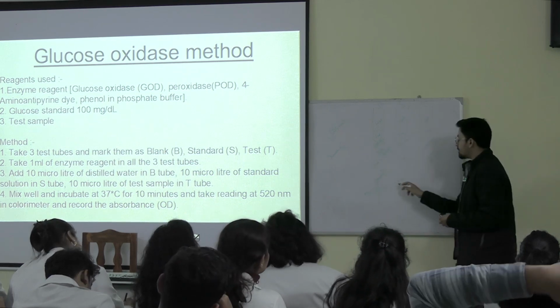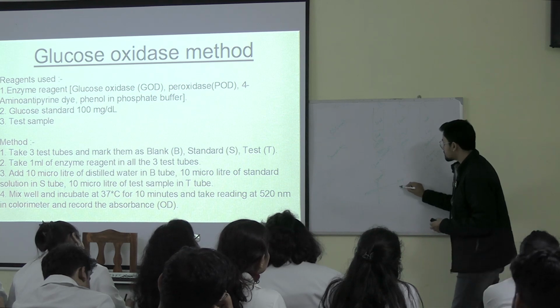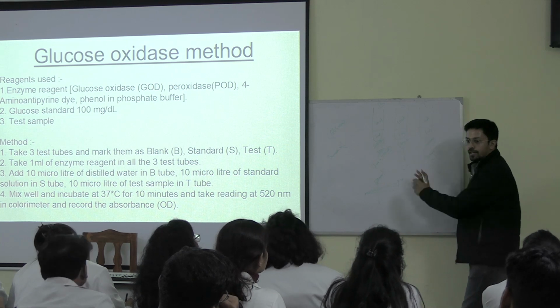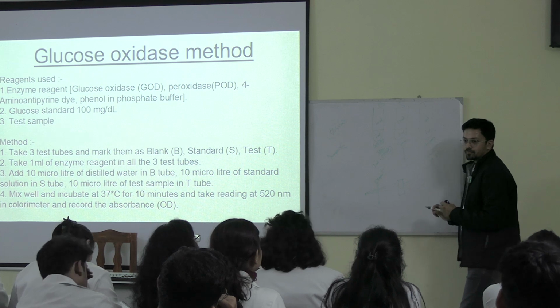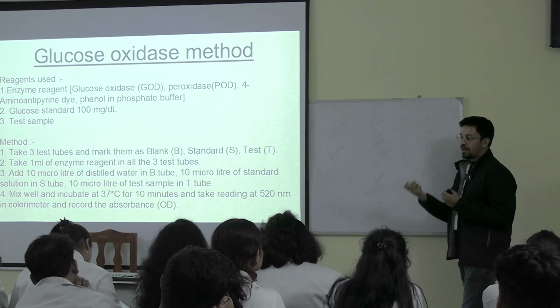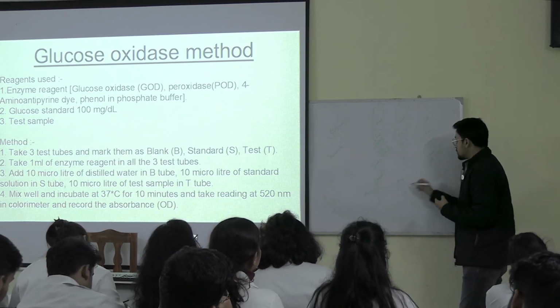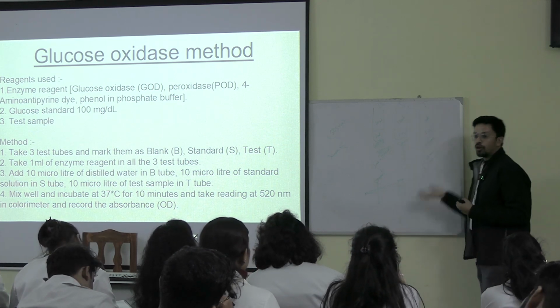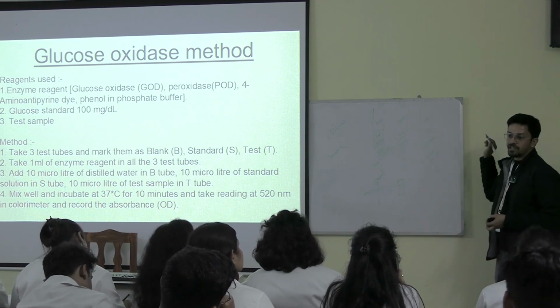The light passes through here, going into the cuvette, and there are small particles of the KMnO4. And what will these particles do? They will absorb the light, and a lesser amount of light will pass from here. Some bit will get absorbed over here by the constituents, by the particles. The more the particles, the more light will get absorbed. So if the concentration increases, then the absorbance will also increase. That is the exact concept: A is proportional to C.